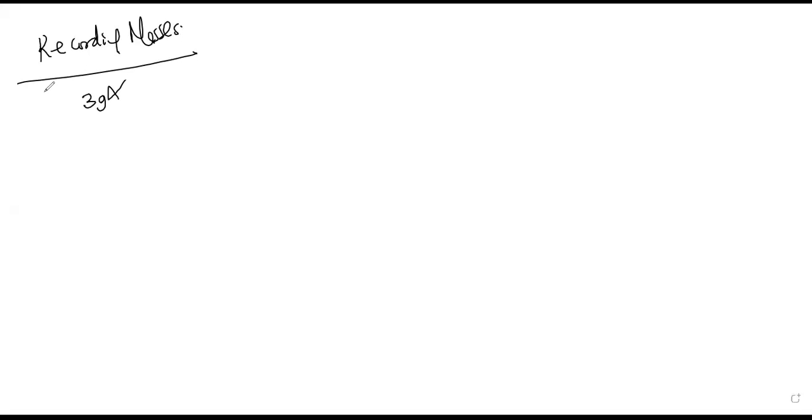So when you record the mass to no decimal place, we give you also no mark. It can be 1 or 2 depending on the weighing scale you're using. But I've told you that our scales always go to 1 decimal place. Chantal, you're putting up your hand.